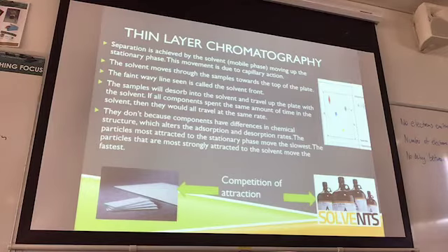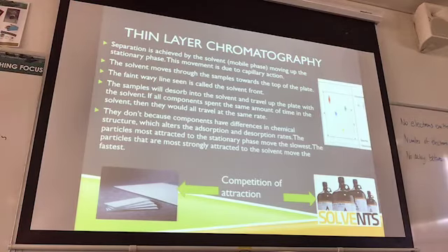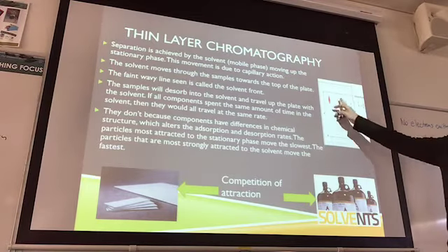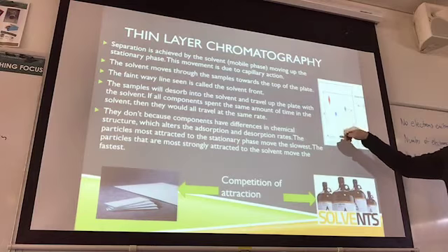So samples that will desorb into the solvent, so they dissolve really well in the solvent, will move up the plate quickly. Whereas substances that are absorbed by the stationary phase, and so therefore are not dissolved in the solvent as well, will move up the plate much slower.